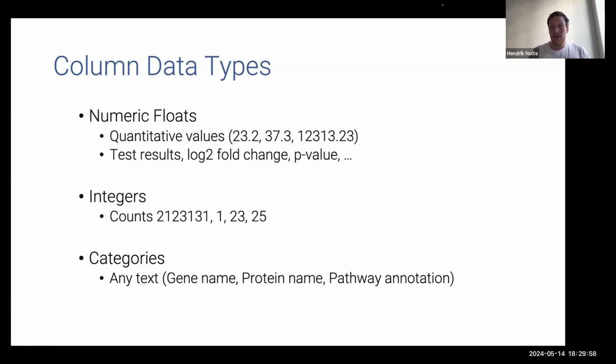What you will see is that in the end, we are just working with the column headers. So we don't have a spreadsheet per se like in Excel, but we're working on the column headers, and these column headers are divided into different types. For example, you can have string data, meaning just text data like a gene name or some annotation, some group, knockout, wildtype, and so on. Something written in text, which is all called categories in InstantClue.